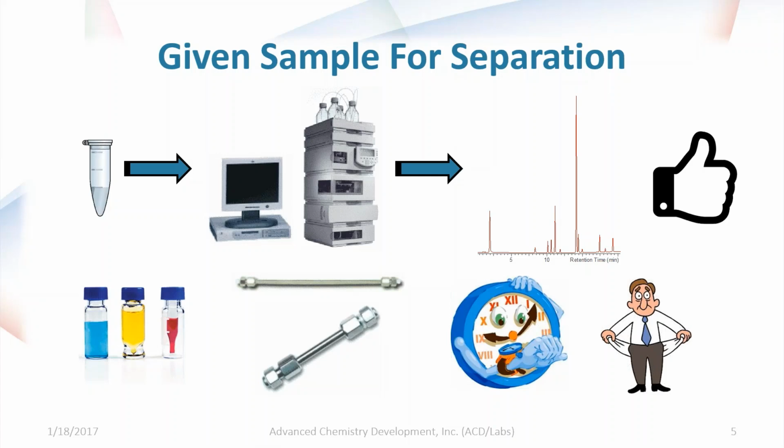Now, as everybody's usually well aware, you're often under time constraints to perform such analyses, and there could also be budgetary or resource constraints as well, such as, say, if the price of acetonitrile skyrockets and you then have to limit the amount of trial runs that you're doing to do your method development because the solvent is so precious.